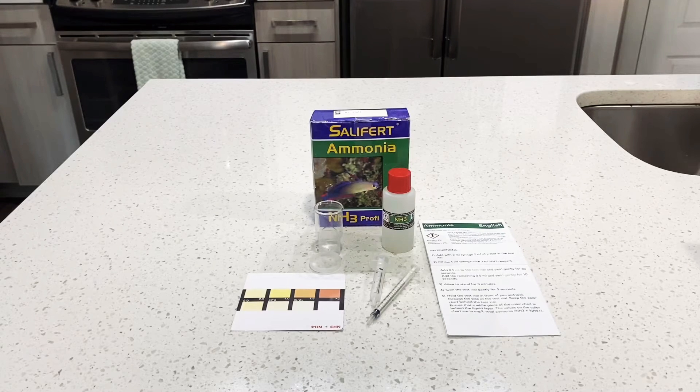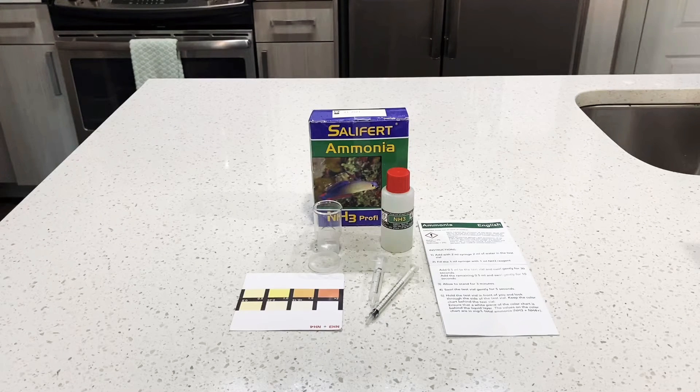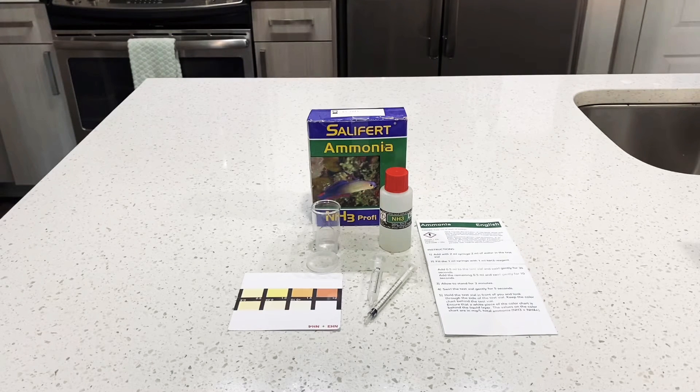For the ammonia test kit, here's what to expect in the package: you get a vial, your reagent, two syringes — one to suck up the water and one for the reagent — and a test kit card with a color chart so you can match up your test to see your parts per million. I'm going to take the syringe on the left, fill it with two milliliters of water, put it in the test vial, suck up one milliliter of reagent, add half, swirl for 30 seconds, add the other half, swirl for 10 seconds, then let it sit for three minutes.